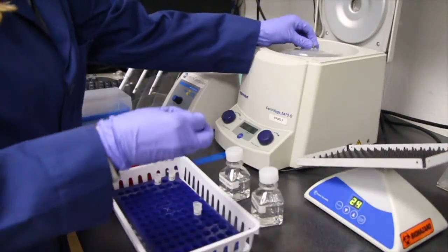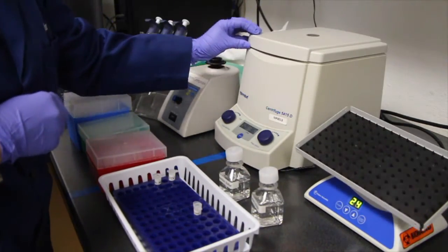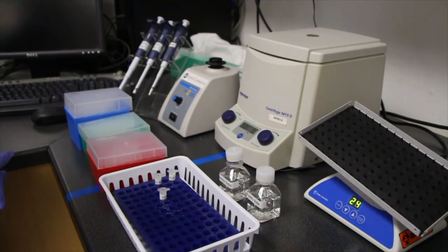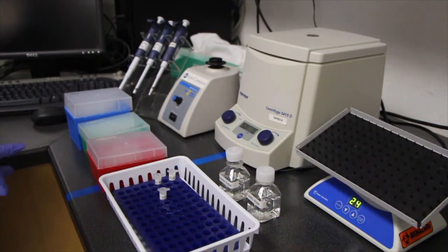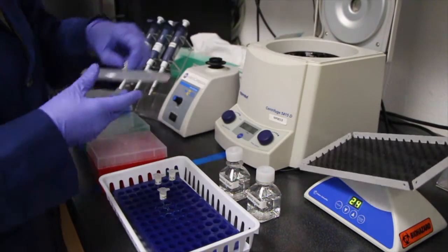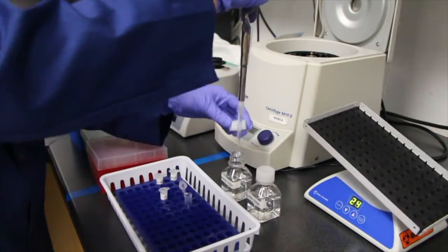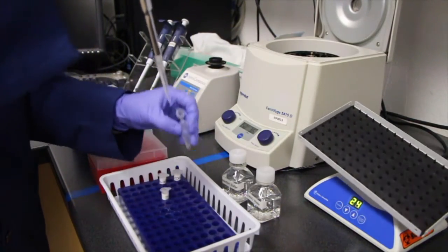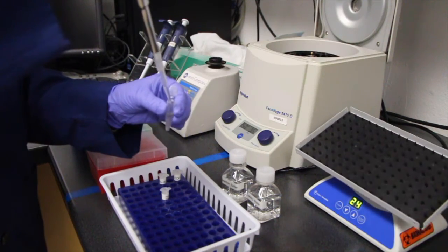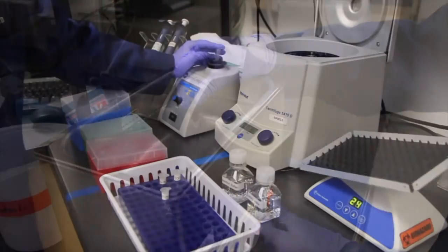After 30 minutes have passed, centrifuge your nanoparticle solution at 3600 RCF for 5 minutes. After 5 minutes, carefully remove your Eppendorf tube from the centrifuge, being careful not to disturb the pellet. Decant the supernatant and discard. Resuspend the pellet with reaction buffer at pH 7.4. Vortex to resuspend the pellet, or bath-sonicate it if needed.